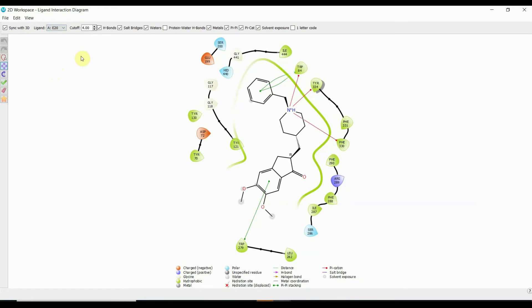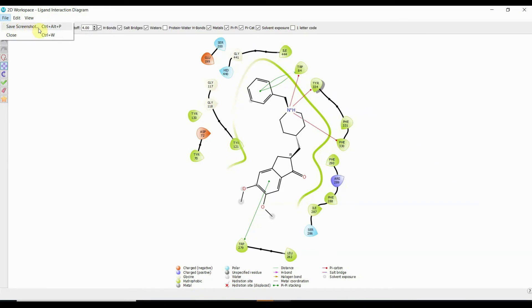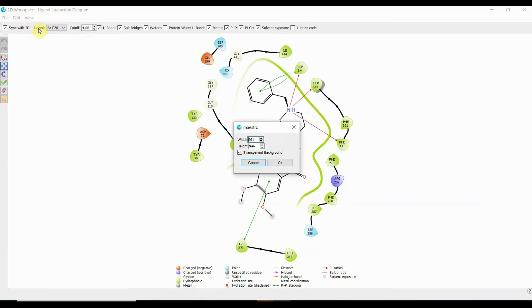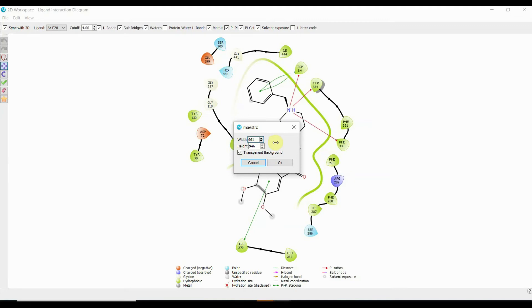So now the question is how do I take this image for putting in my research article? We are going to come to File and then choose this option which says save screenshot. This width and height - if I will not change it and keep it in the same digits which is 661 by 946, this image my friends is very very small and when you are going to stretch it, it is going to pixelate and the journal might send you the image back.